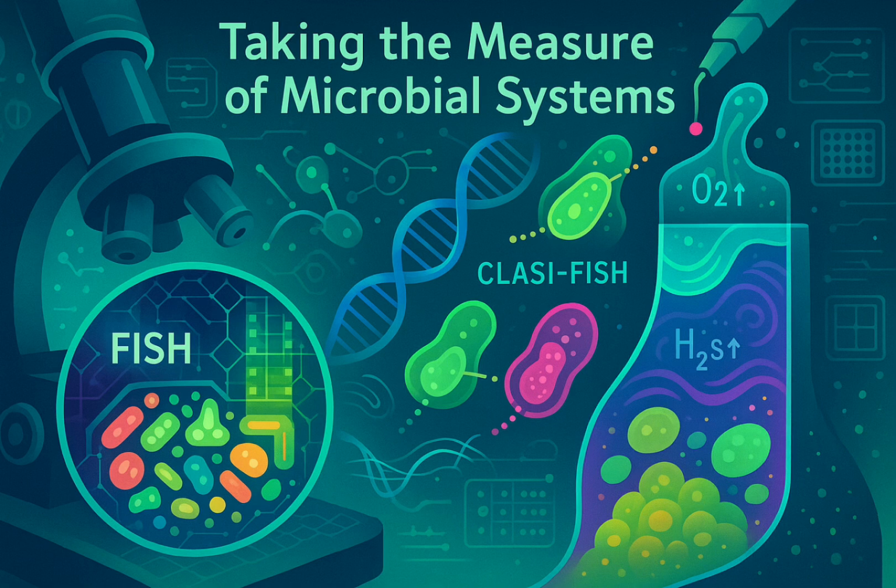Then there are agar dilution tubes, which are good for anaerobes. You mix the sample into molten agar, let it solidify, and colonies grow embedded inside. And liquid dilution, like for the most probable number or MPN counts, can sometimes get you down to a single cell type, starting a culture in a tube, but it's less common for isolation itself.